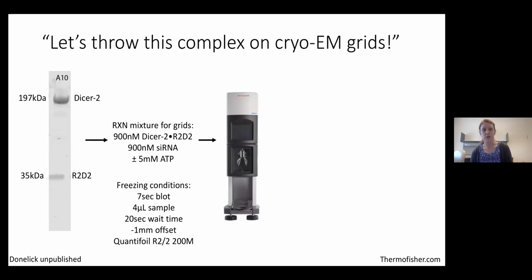Now, while I just showed you on the previous slide that ATP was not required to bind the siRNA to the complex, we are still curious if there would be any conformational changes in the helicase domain upon the addition of ATP. And then I have my freezing conditions below, where we froze our grids using the Vitrobot. I will note that we used Quantifoil R2/2 grids to be able to use multi-shot recording.